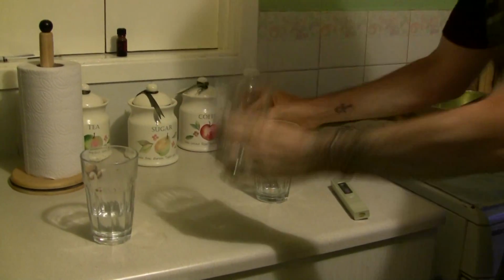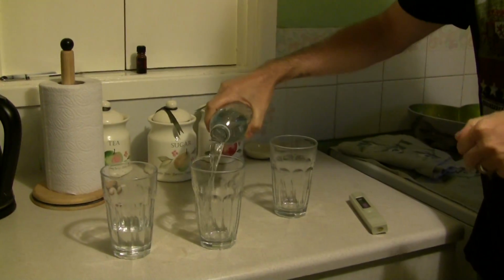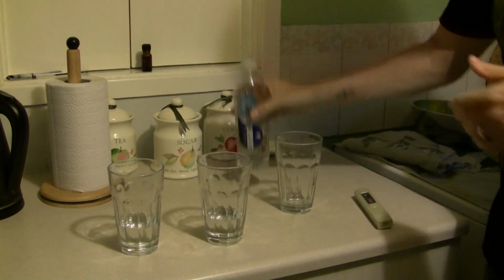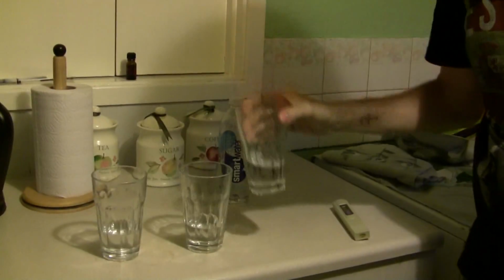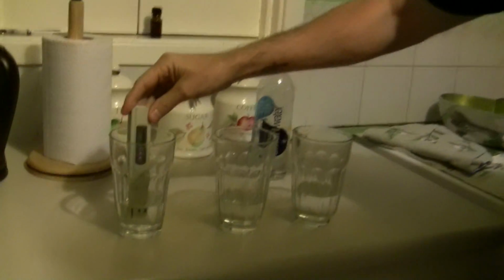Next, we're going to get the smart water, and we're going to put the smart water here, and we'll measure that. Now that's the water that we bought today. And then here, I'm just going to get water from the tap. One would assume that the water from the tap is probably the least clean water. And we're going to see what the TDS meter says.